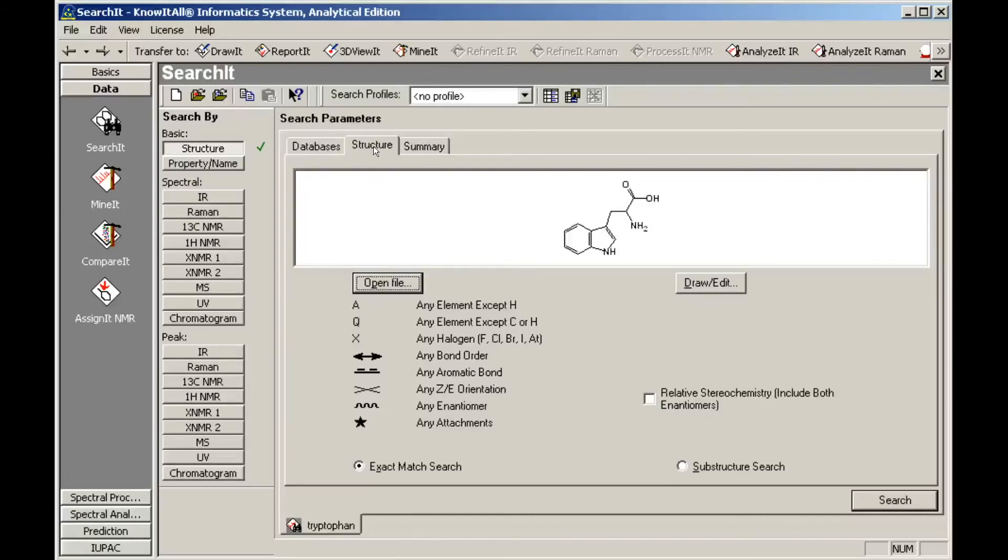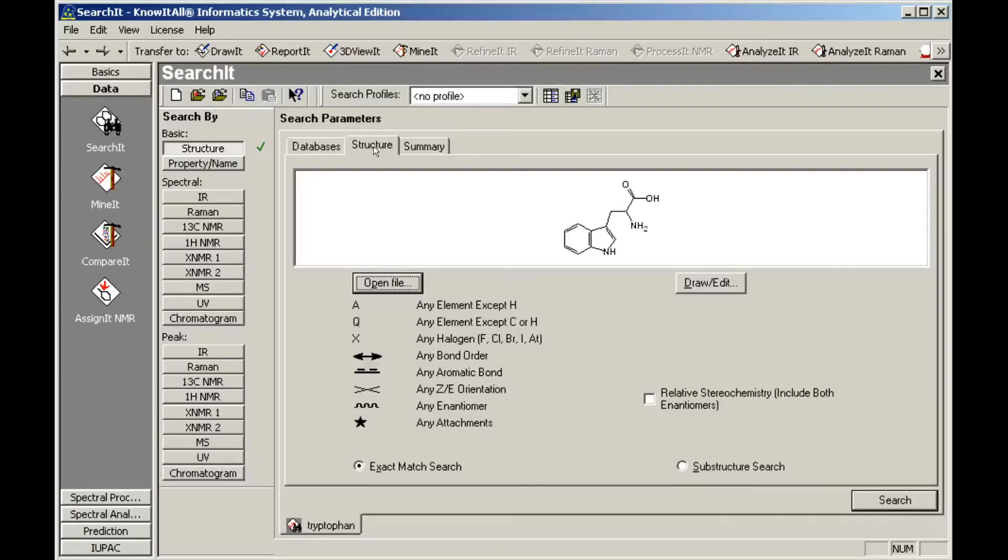We'll change the exact match search to a substructure search. Now, rather than finding only exact matches for the search structure, the search will return all records that contain the query structure as a part of the database structure.